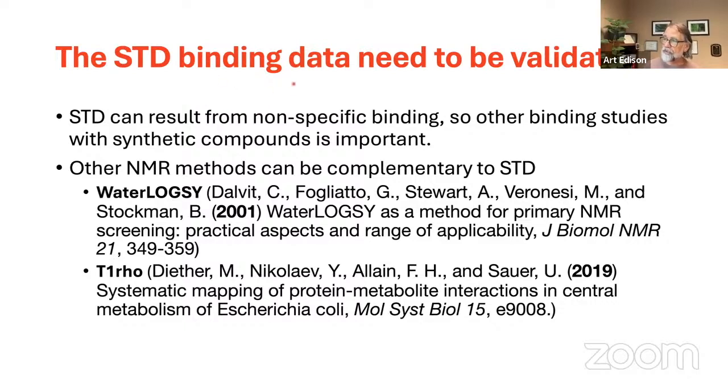So the binding data do need to be verified because saturation transfer can result from non-specific interactions. And so other types of binding measurements with synthetic compounds are important to validate that this is actually real binding. And there are other NMR methods that we also have going in our lab that are very complementary to STD.